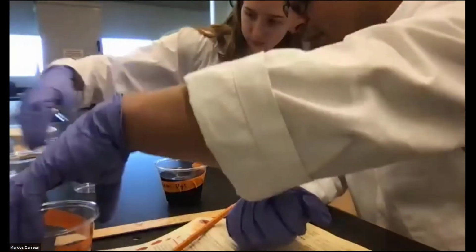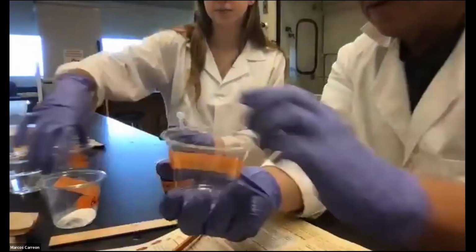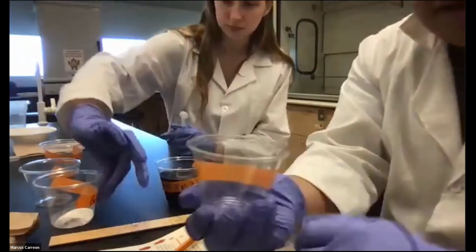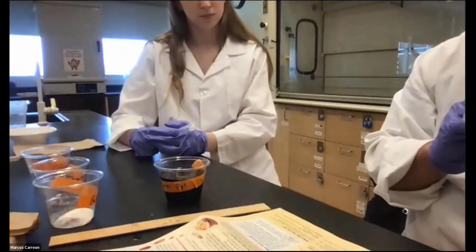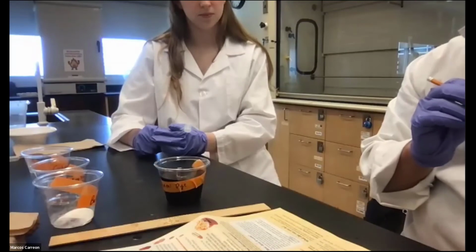vinegar. So now we have another cup here. We're gonna label that vinegar with the cochineal. So we're gonna do that now. And then we're also gonna add vinegar to here. This is the process that a lot of the chemists use, adding vinegar, where we extract the solution, cochineal on here.